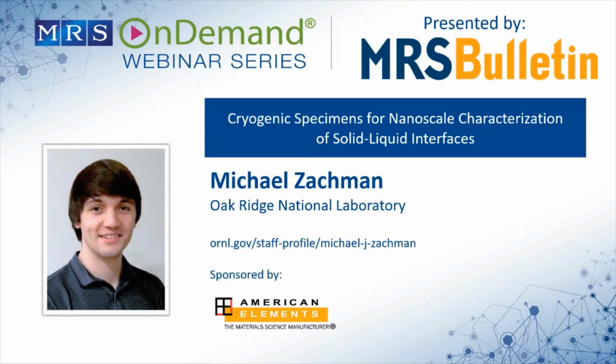But getting it into the microscope quickly is then very important because you have to come out of the nitrogen and then into the load lock of the microscope. And so the more quickly and smoothly you can do that, the less risk of contamination on your sample. For example, that's one of the areas I think could be improved at some point, a better way of protecting that sample in between. But right now you just pull it out of the nitrogen and put it into the load lock quickly.